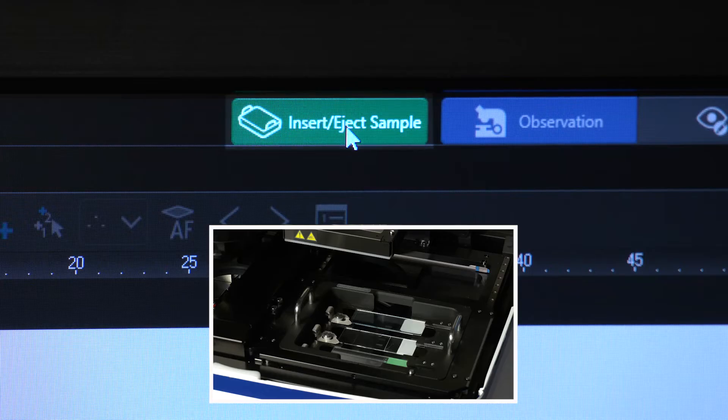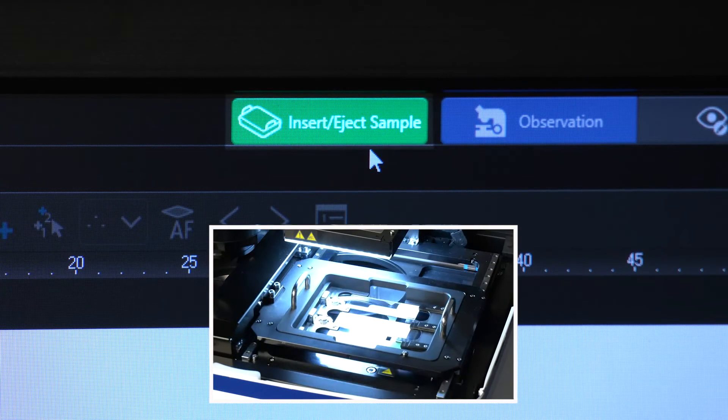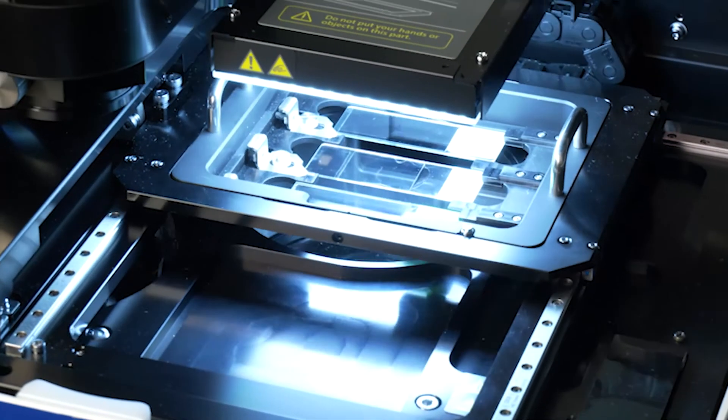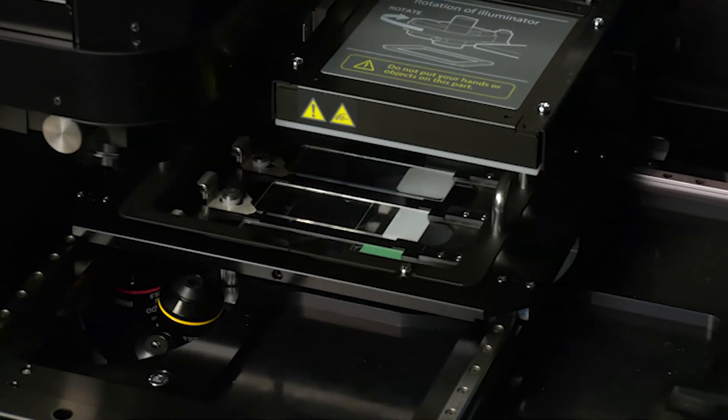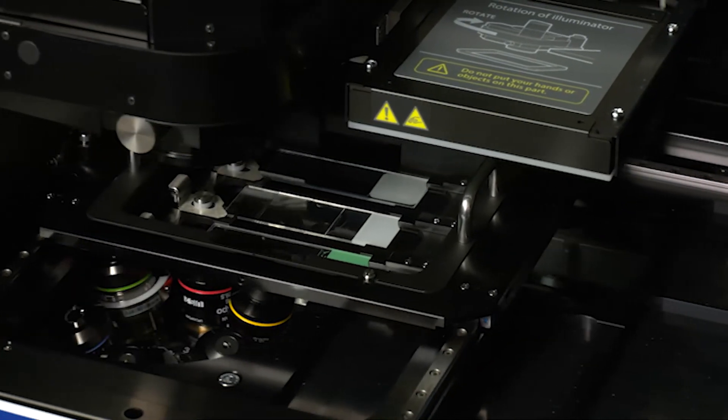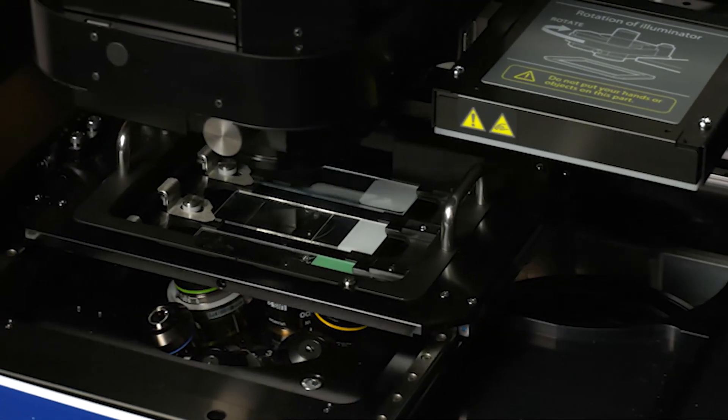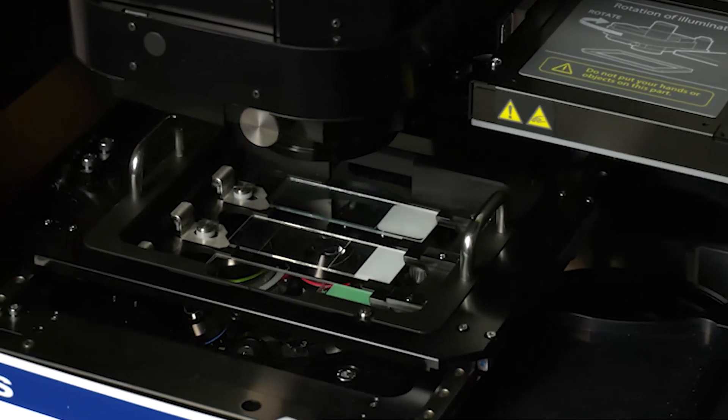With one click, the APX100 microscope's Smart Sample Navigator makes sure you're ready to start capturing image data within just 10 seconds.